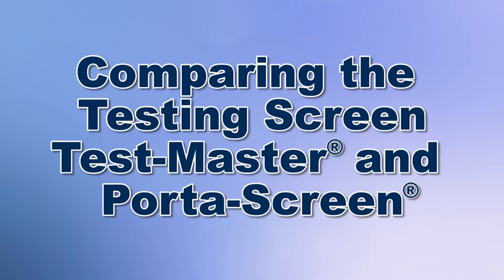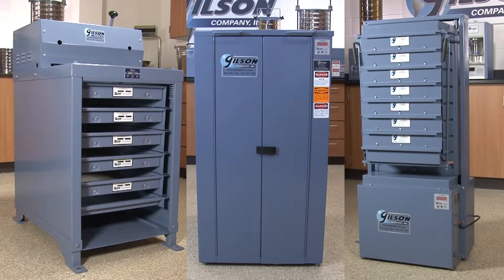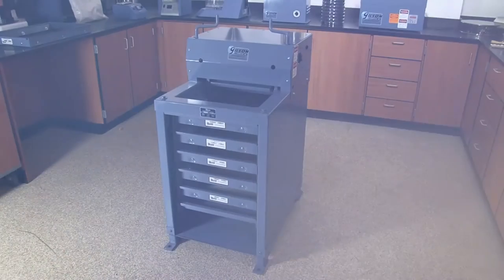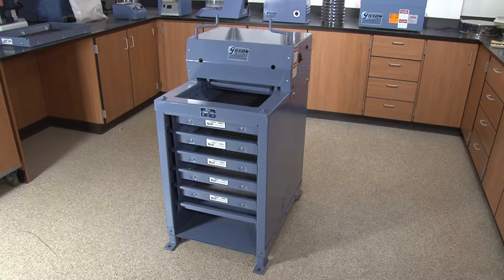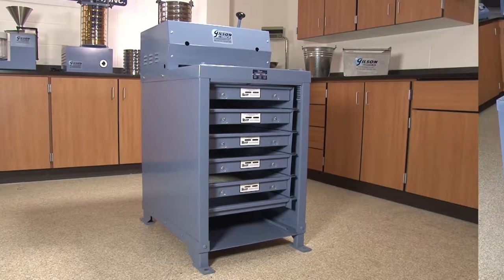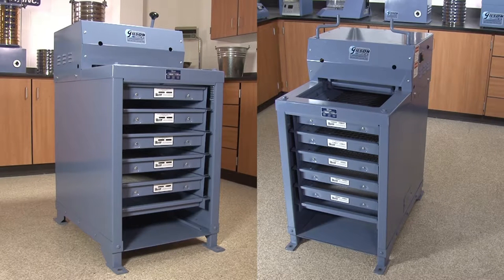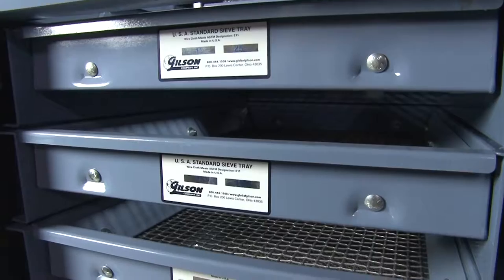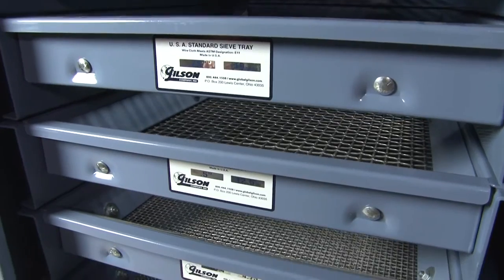When your lab needs accurate and reliable particle size determinations, Gilson is your best choice. Testing screens have been the gold standard for particle sizing of large samples for over 75 years, and Gilson offers several models to choose from. The Gilson TS1 and TS2 testing screens are designed for busy high production settings and will quickly process up to a cubic foot of material into six size fractions in as little as five minutes.